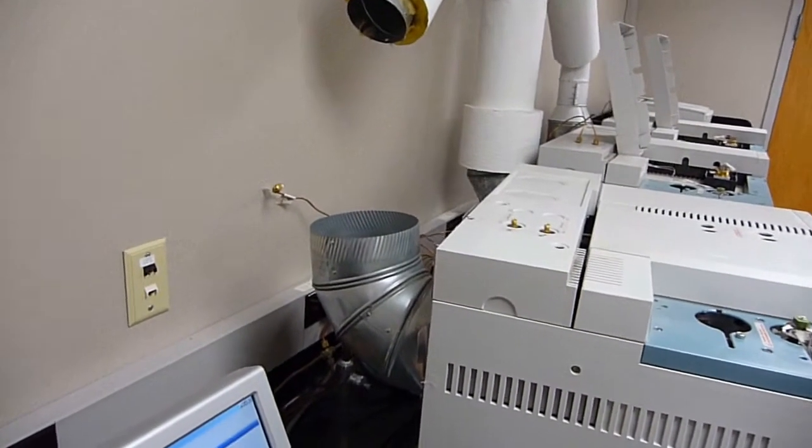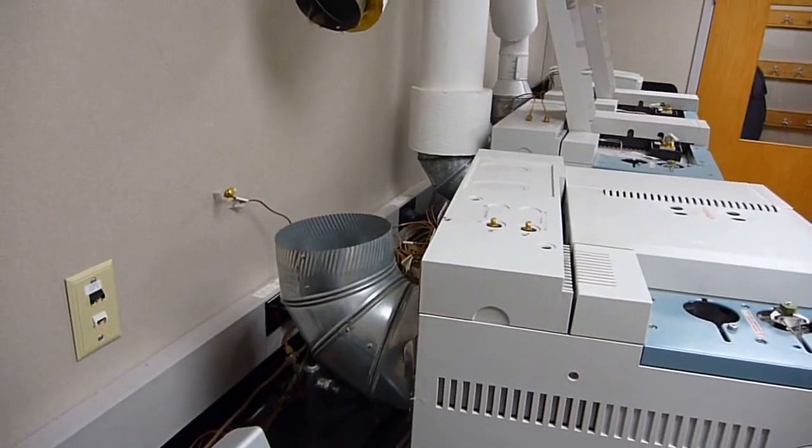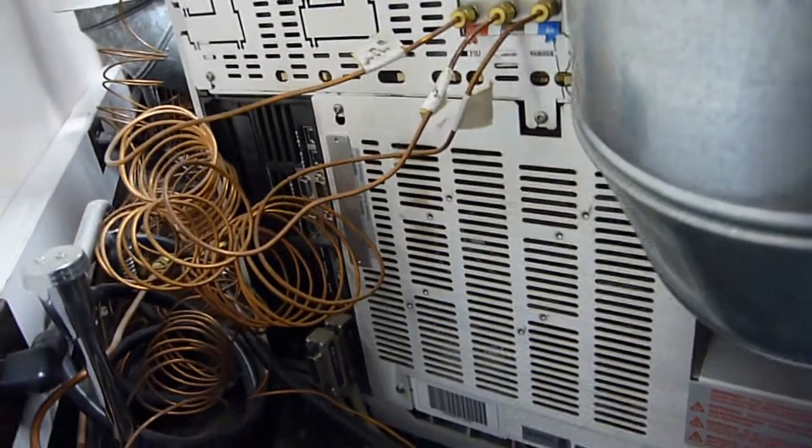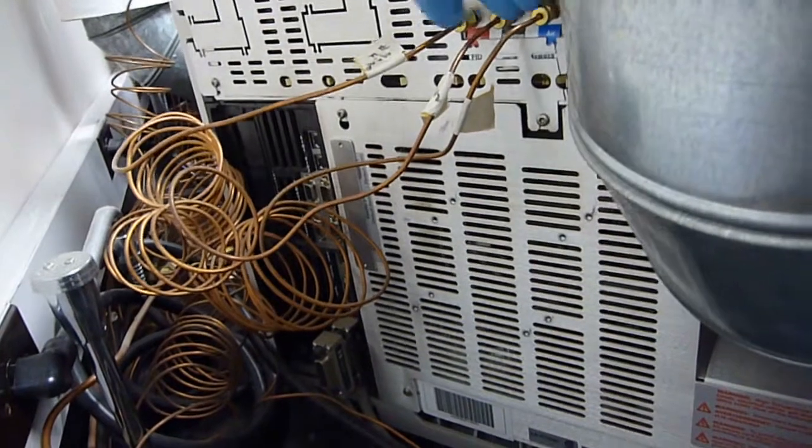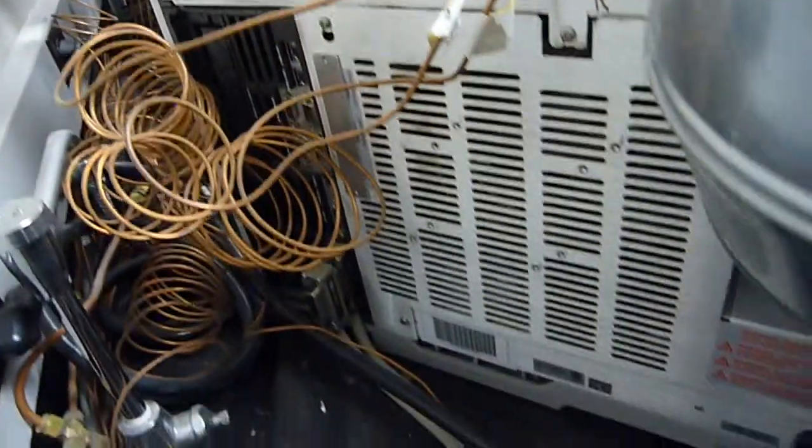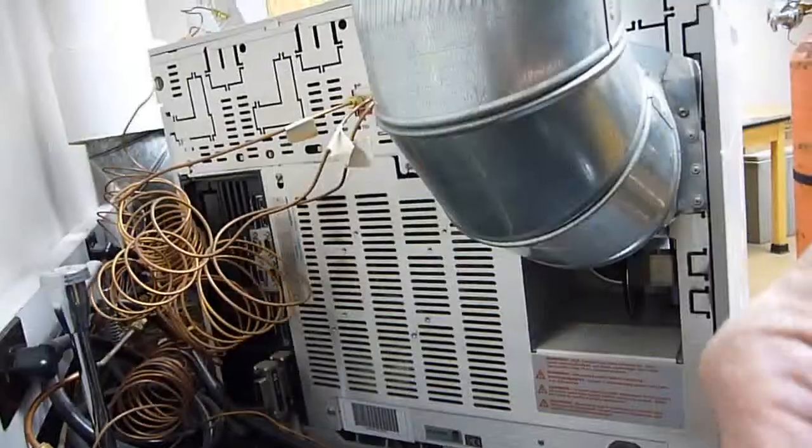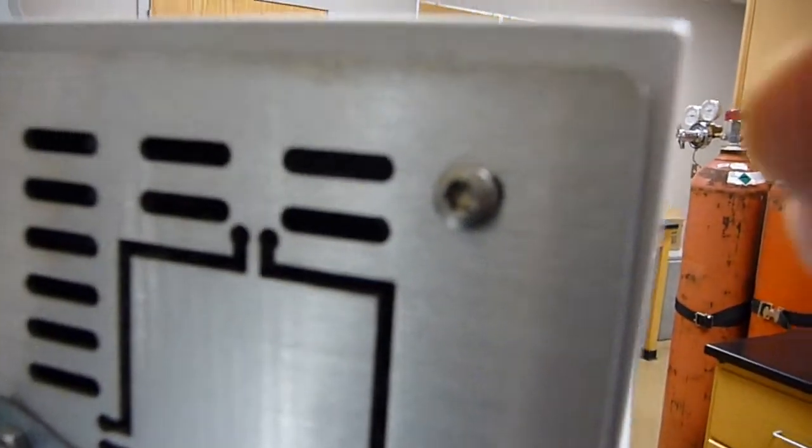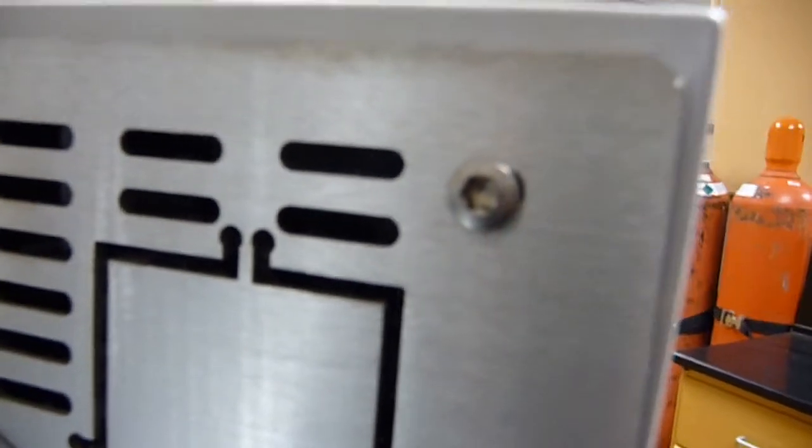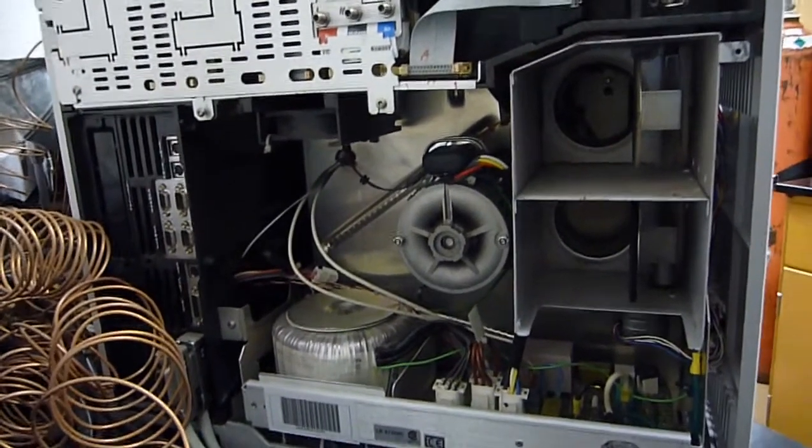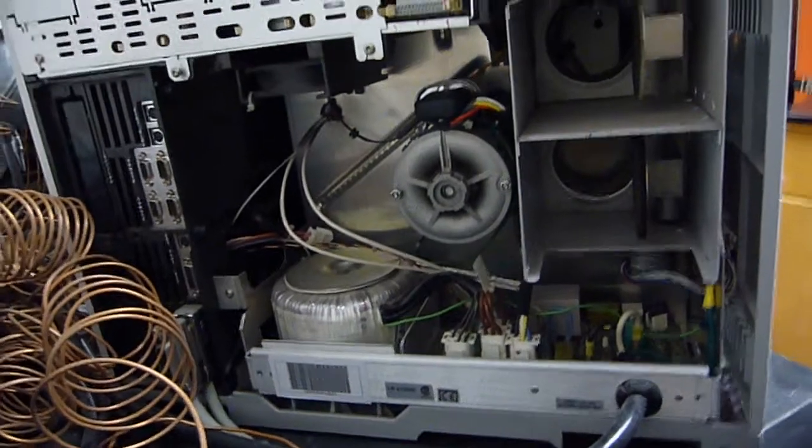And next we will reposition the GC to work on the back. But before doing that, I want to remove and cap these gases to the FID. And of course, unplug the power. So what we have to do is take the back panel off of here, and as usual, Hewlett Packard, so these are T20 screws.